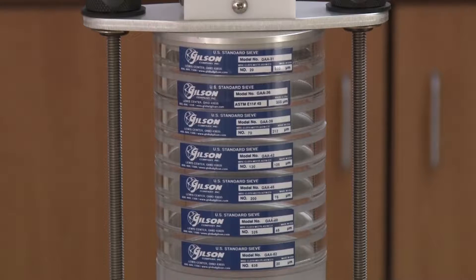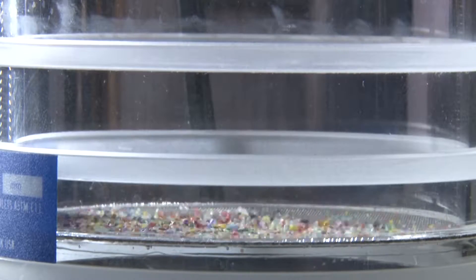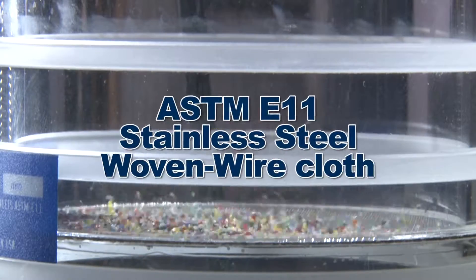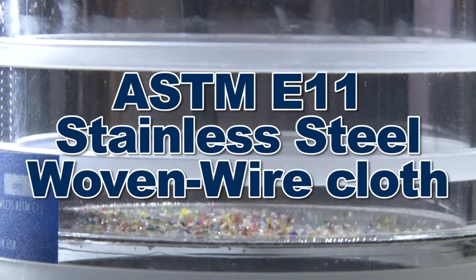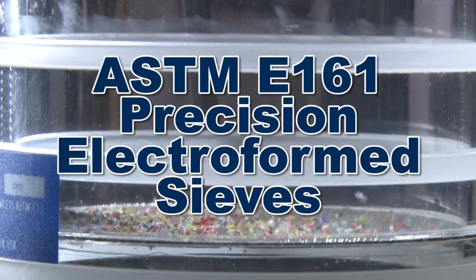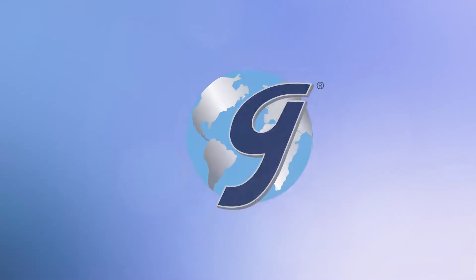Gilson's three-inch clear acrylic frame sieves offer enhanced sample visibility during testing. They come in either ASTM E11 stainless steel woven wire cloth or ASTM E161 precision electroform nickel mesh.